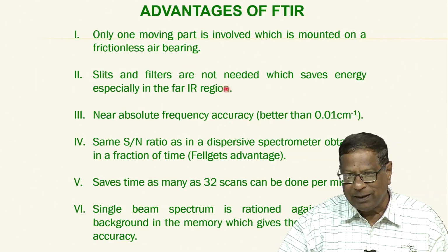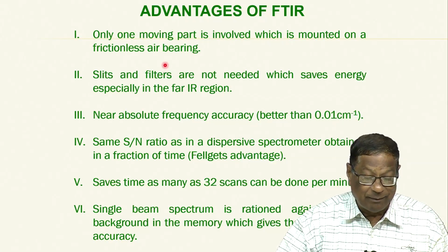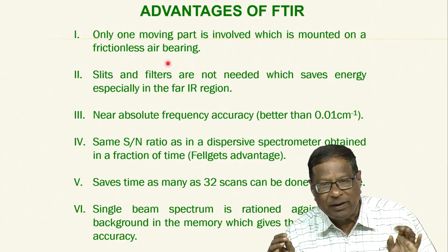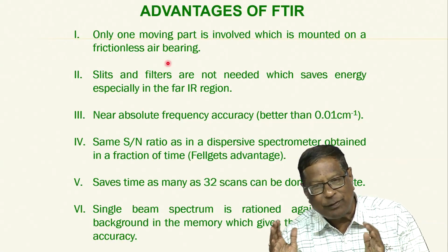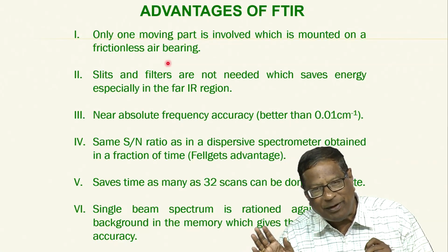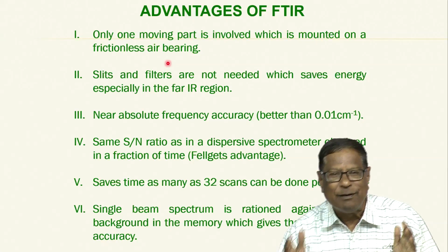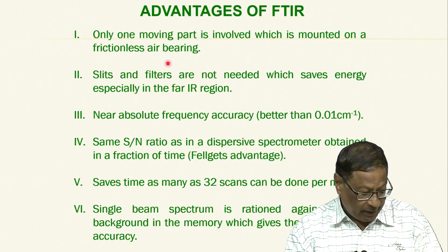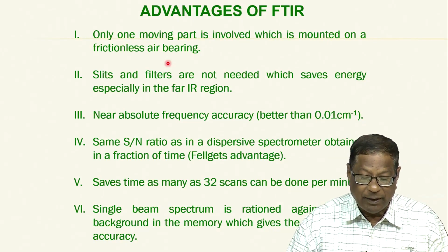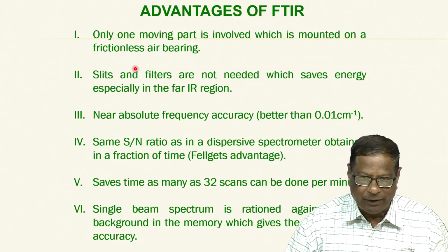I may have it here in my slides, but let me show it in the next slide exactly what it is. Now, assume that what we have is just like an infinite Fourier mathematical expression which contains all the related numbers of an electromagnetic radiation from IR coming through the mirror. So, it is something equivalent to the FTIR Fourier transform equation.